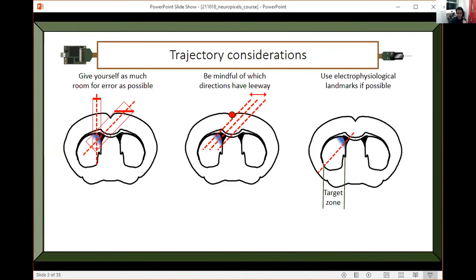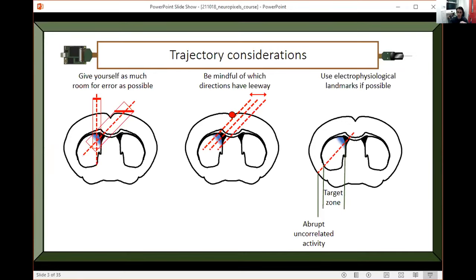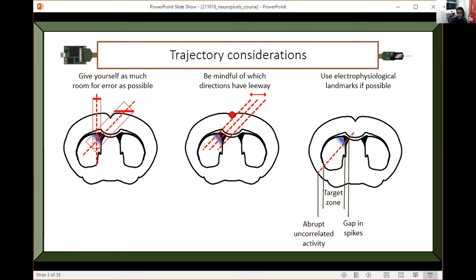What you want to use is these electrophysiological landmarks to figure out based on just the recording where your probe was. In my case, the target zone was within the striatum. There's a big difference in correlated activity between the striatum and the cortex. If I take the multi-unit activity of these two regions, they're very correlated within and very uncorrelated across. So I have this abrupt change in activity. On the medial side, I have this gap in spikes that comes from the ventricle. That means the first spike I see has to be in the striatum.